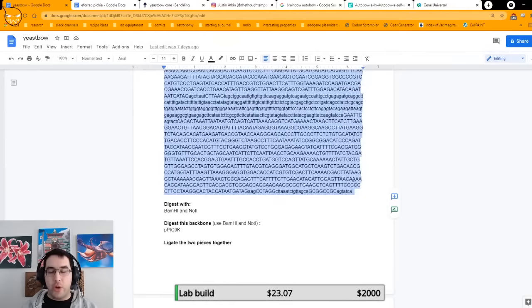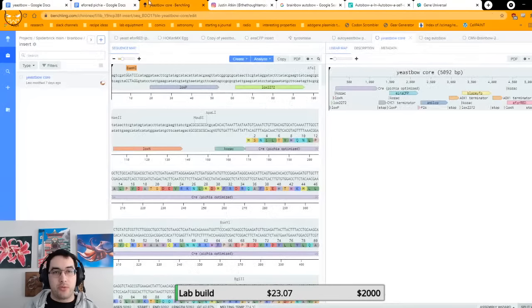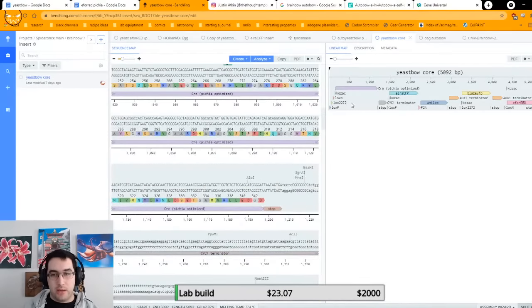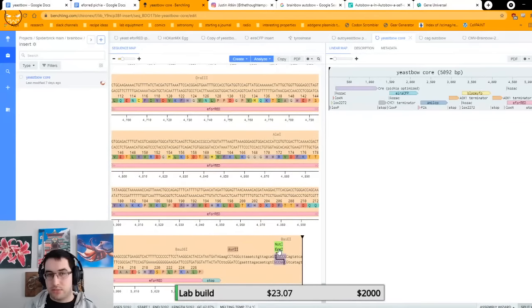So it's like, okay, great. They've printed that. What's the next step? I tell them, okay, I want you to take this piece and digest it with these two enzymes, right? So BamHI and NotI, which if we go over to Benchling, you can see BamHI is on the front end here. And if we scroll to the bottom, NotI is right here. Perfect.